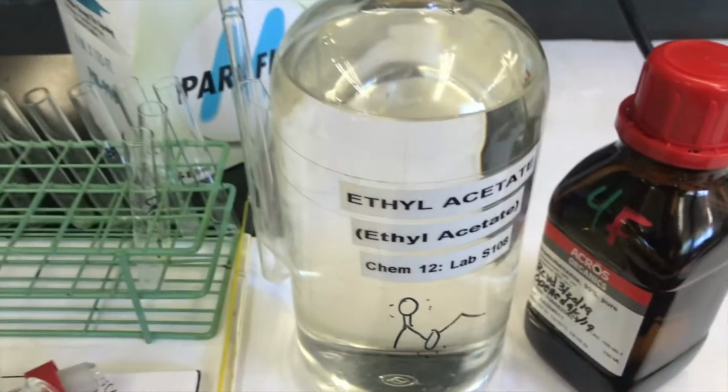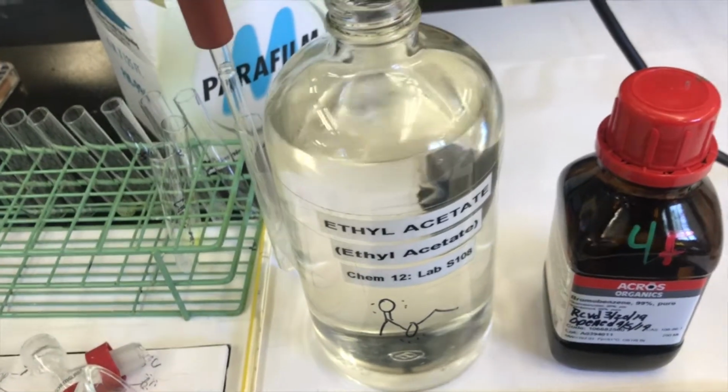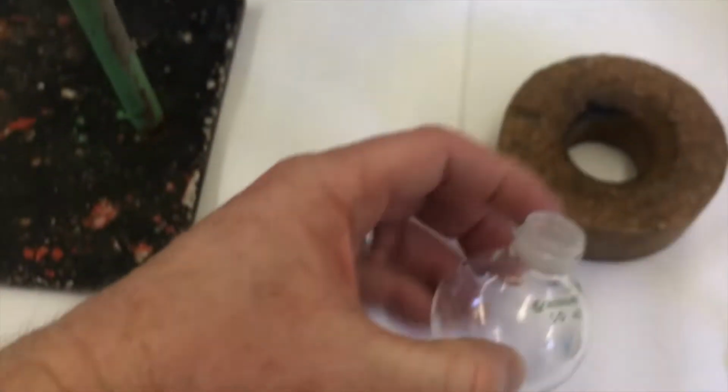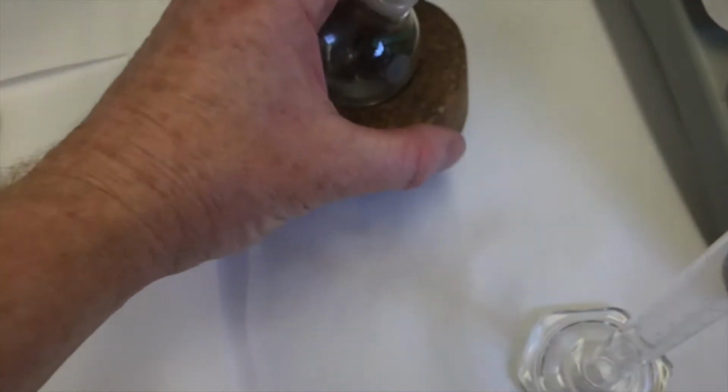So we'll be distilling a mixture of ethyl acetate and bromobenzene. So let's measure those out first. I'll get some ethyl acetate and bromobenzene into this 50 milliliter round bottom flask. Can you read it? Yeah, 50 milliliters. I'm going to add approximately 13 milliliters of each.